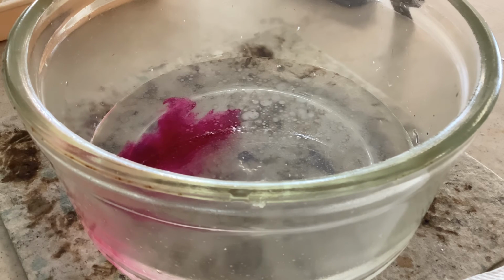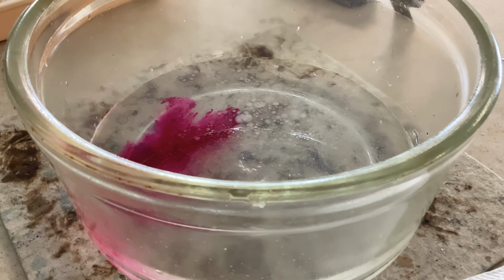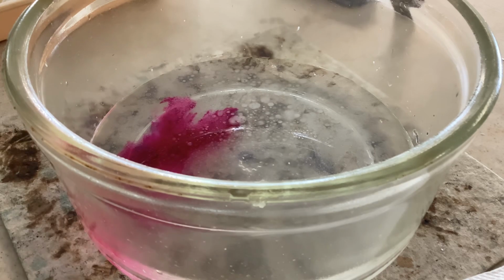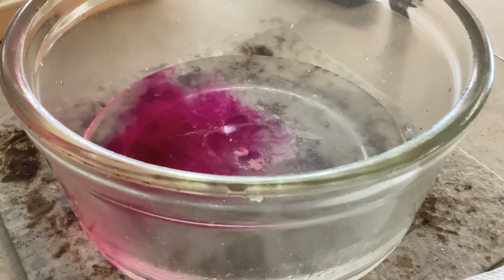They are just turned into another form instead of a piece of solid metal, but they form something called a compound. So then you can see the indicator turns from colorless to this pink color.